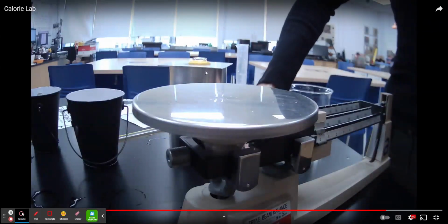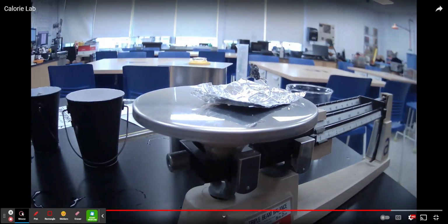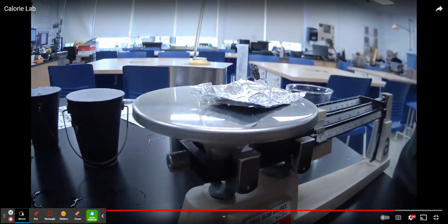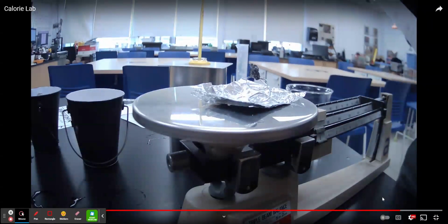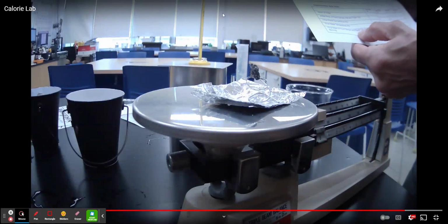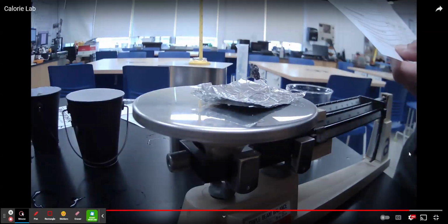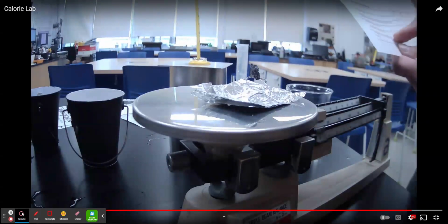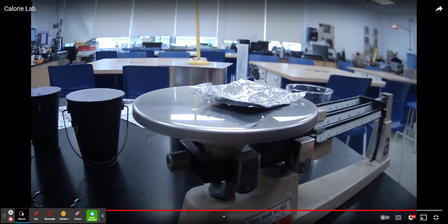You're going to put the thermometer in to measure the water temperature while you're weighing this. And you're going to record this in the row for aluminum foil, paper clip, and burned food. And then you're going to record, once the thermometer stops moving, under final temperature. Remember, you must be wearing full gear the entire time. Hair has to be tied back, nothing hanging, no strings, because you are using flames. The paper clip and the combustion chamber may get hot.